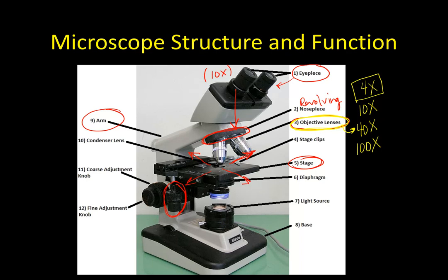One of the other challenges when you're looking at something microscopic is if you need to shift your slide, the chances of you shifting something 1/100th of a millimeter are pretty low. So when you've got these knobs that allow you more control as to how that slide shifts, it's very, very beneficial. So again, these are going to be the stage knobs.